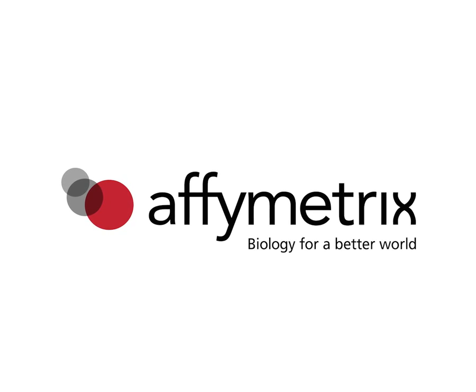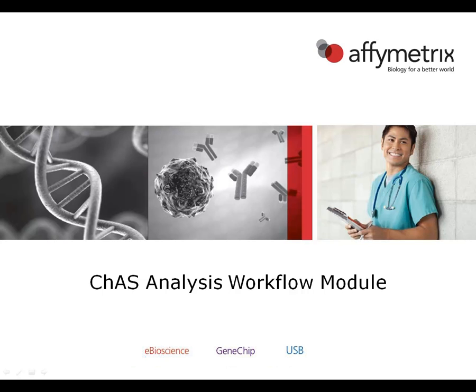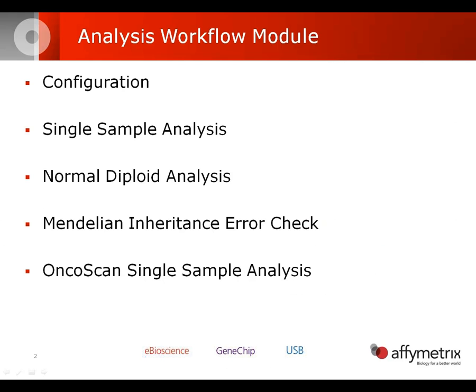In this video module, we're going to walk through the different analyses that you can do in the Analysis Workflow module. Our first step within an installation is going to set up the configuration, which means to assign an input path, which is where our cell files would be housed, an output path, which is where the chip files will be written to, as well as a QC history path.